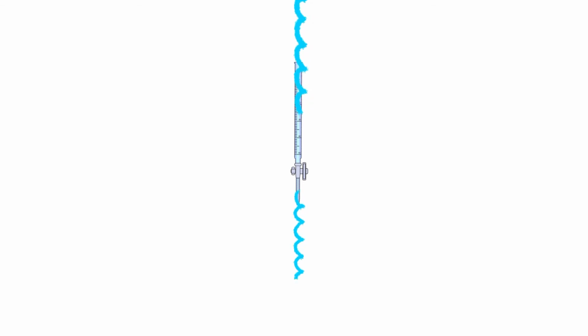Attach the burette to a retort stand and set a waste beaker underneath to catch any waste titrant while rinsing with the titrant. The majority of chemicals have risks associated with them. As a result, never assume that a chemical can be washed down the drain. With the stopcock open, pour part of the titrant into the burette, washing down the sides and any water droplets left over from the previous wash. If there is water in the burette, it will lower the concentration of the standard solution.